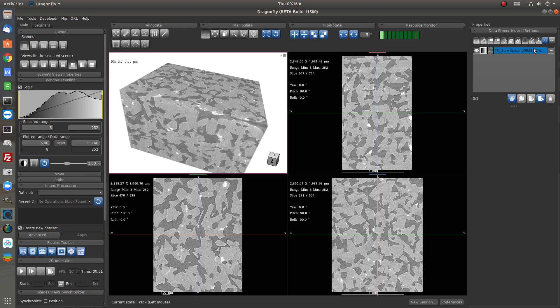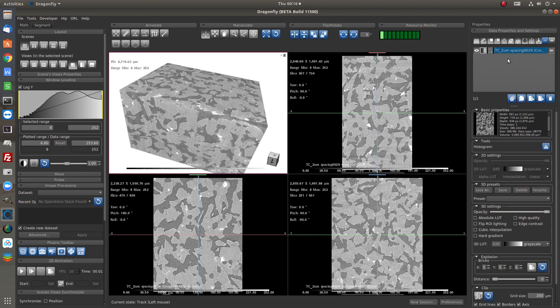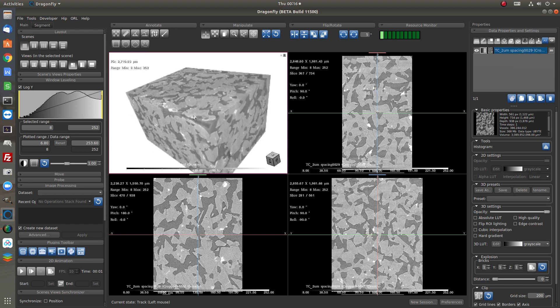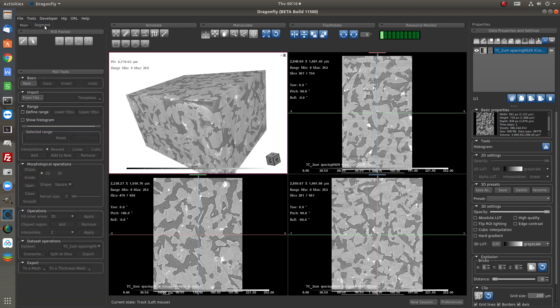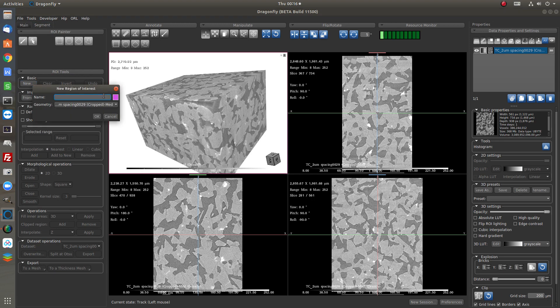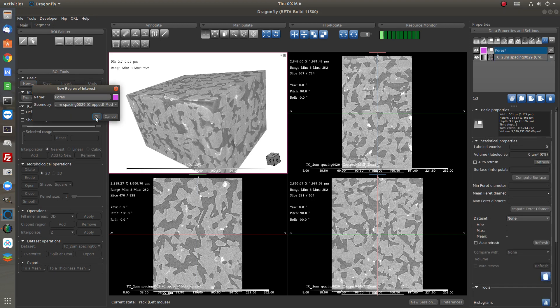So we have the data set here in 2D and 3D. To do the pore segmentation we need to create a new ROI first. So here we create a new ROI, region of interest.